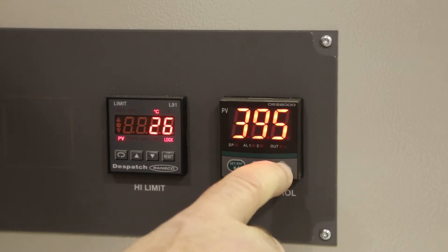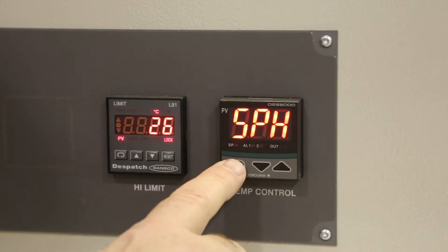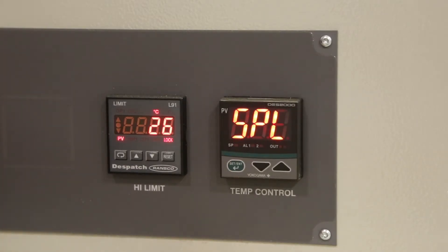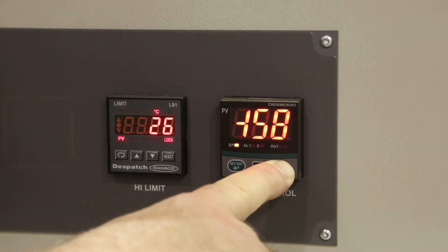Press the up arrow if you go too far. Press the green button once to set the value and two more times to get to SPL, which is the low limit. Use the arrow buttons to set this to 70 degrees.